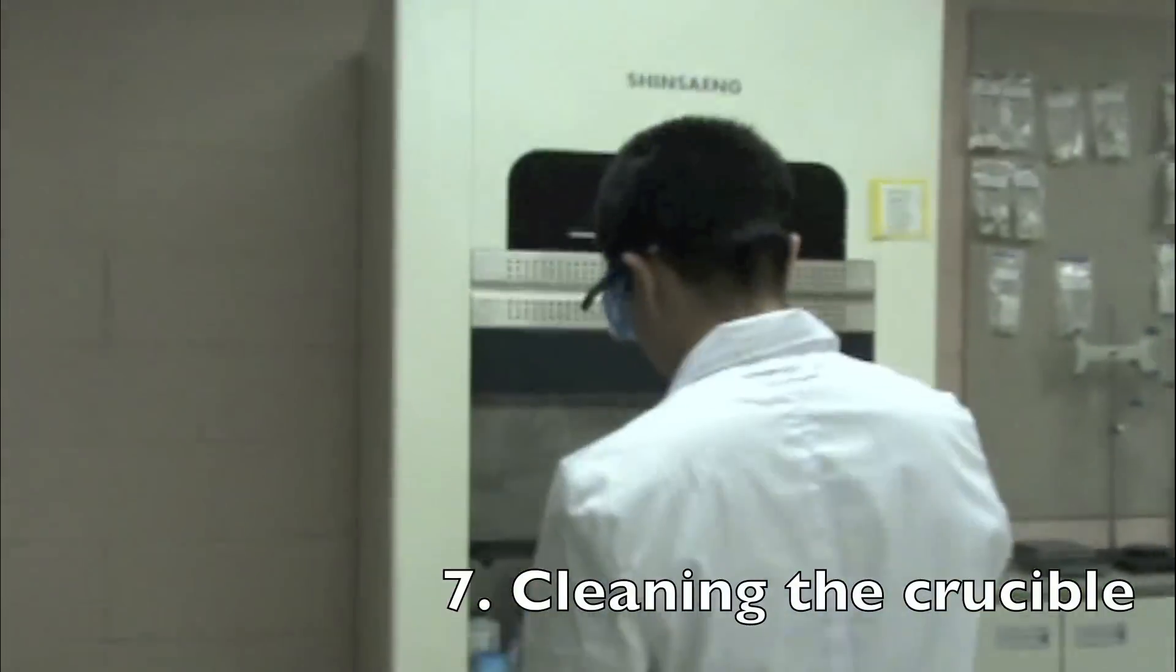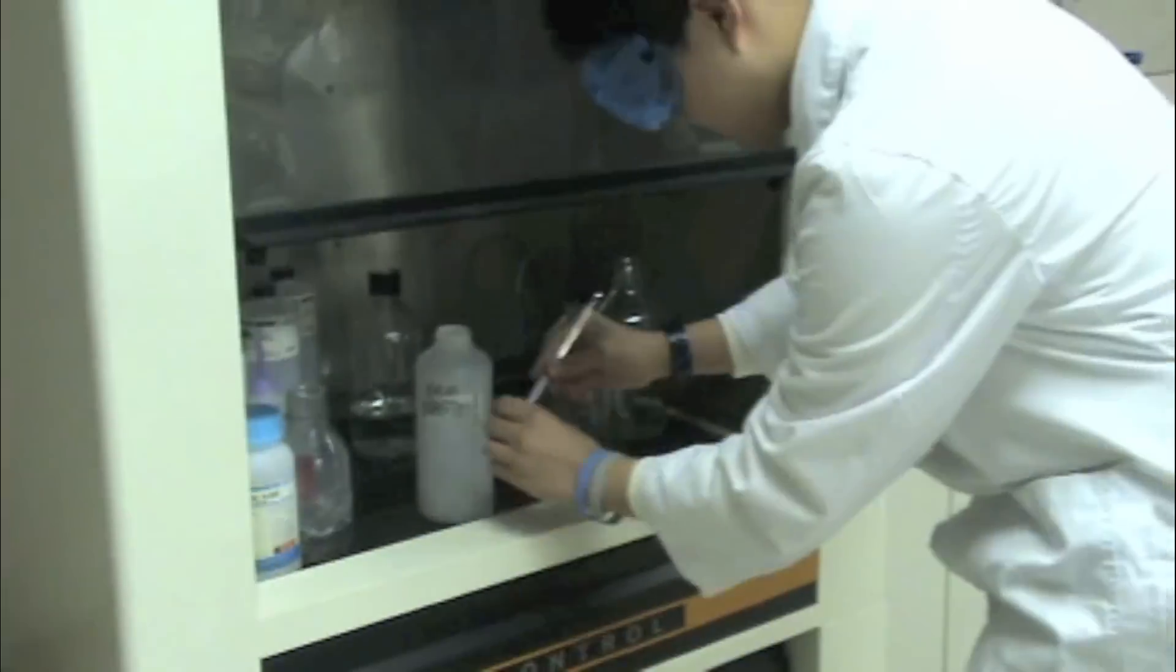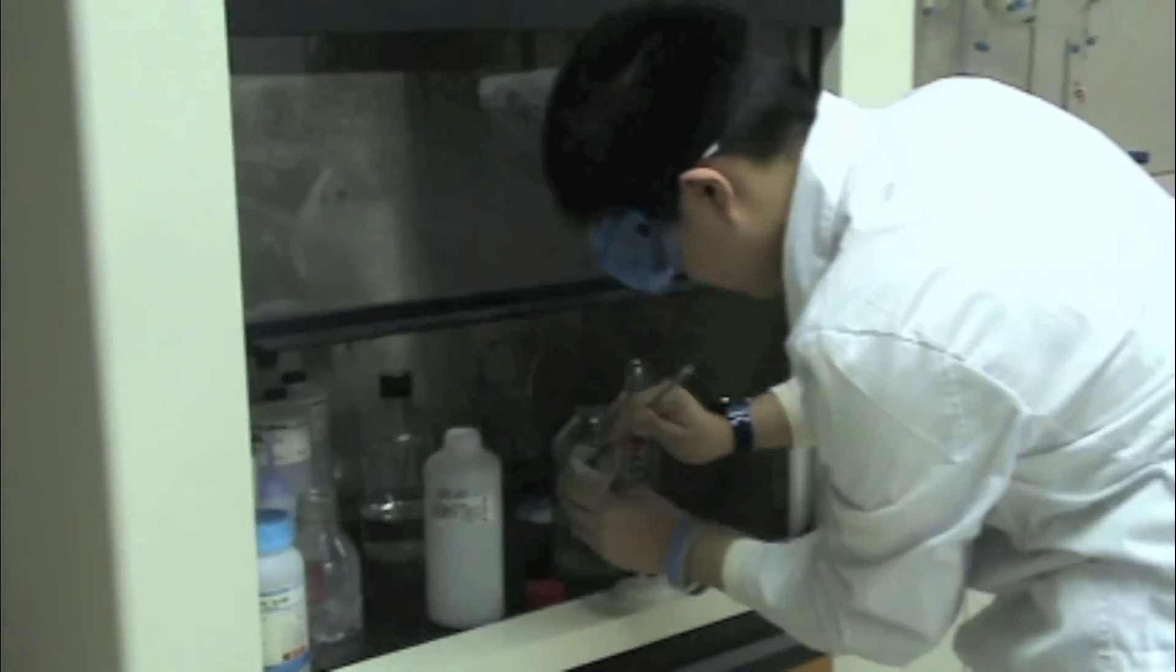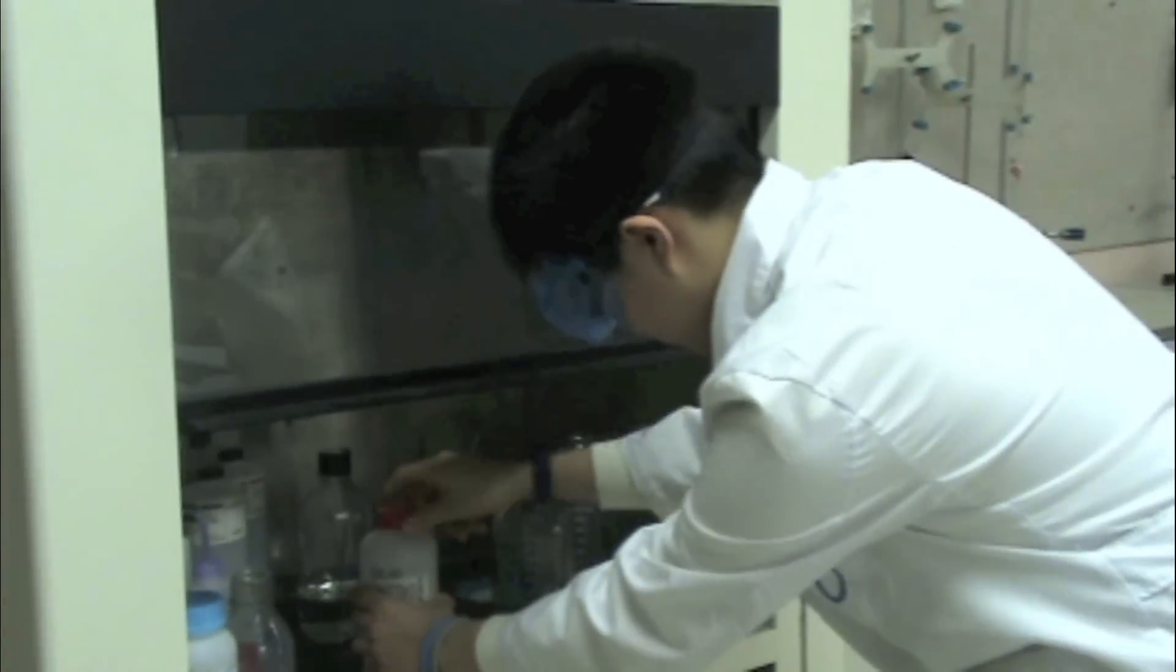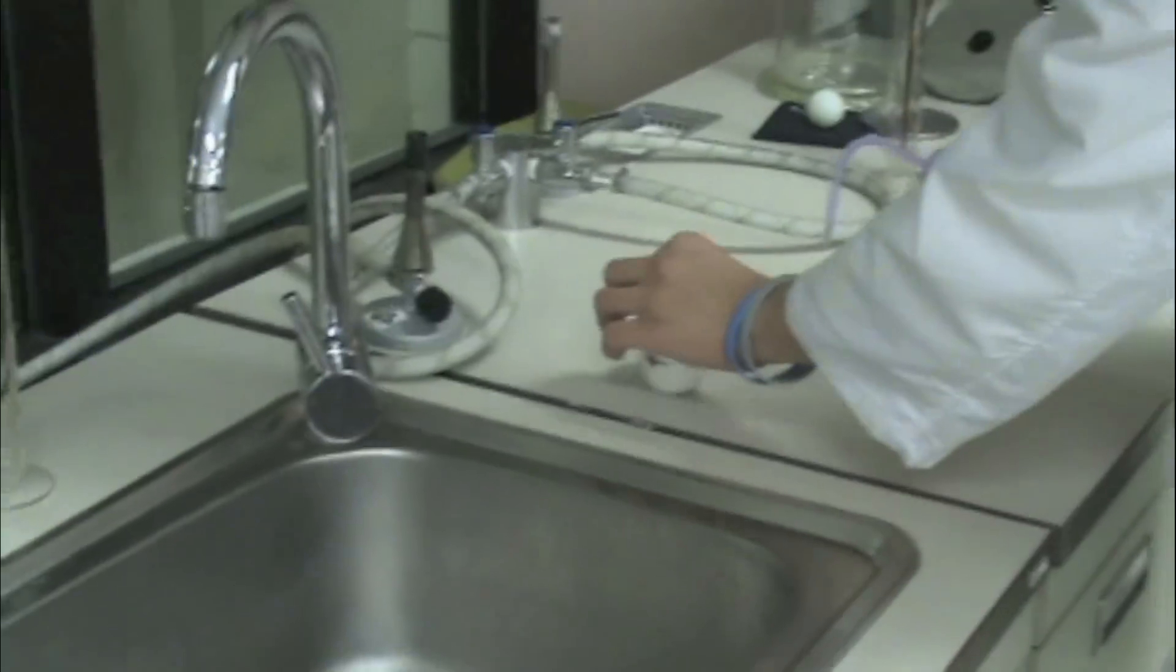Don't forget to clean up after your experiment. To clean the crucible, first, use a spatula to dispose of all the solid waste in your crucible into the solid waste container. Then, rinse the crucible with distilled water.